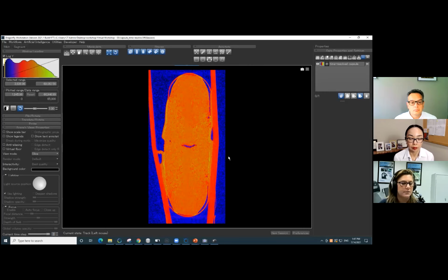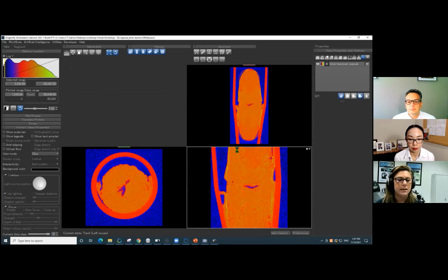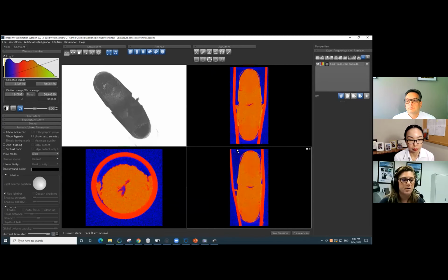So we could follow this for a number of minutes and vary the amount of water that we applied and investigate that a little bit. So that's an example of a 4D experiment or time resolved experiment that's very easy to do in a laboratory.